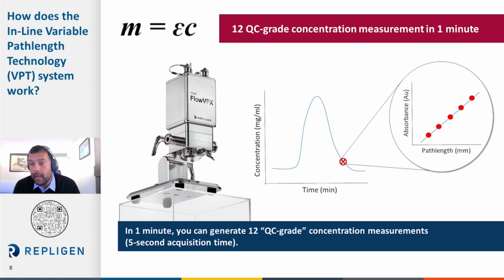So if something like a bubble passes through, you'll see a drop in R-squared, which then the scientist or the operator can look at and say, okay, this is a bad measurement because the R-squared dropped. So for the good measurements, your R-squared will be 0.999 or higher.